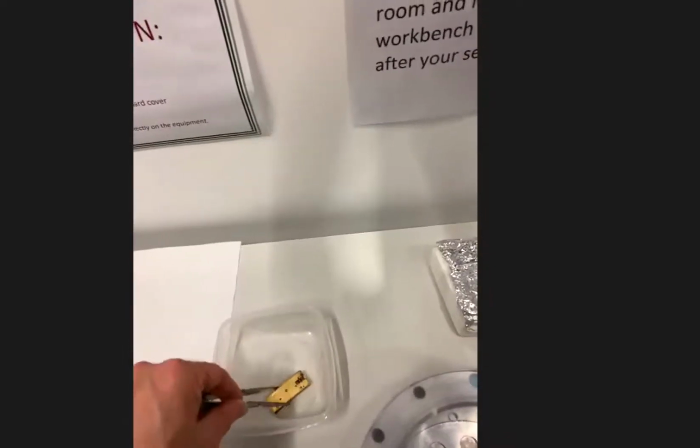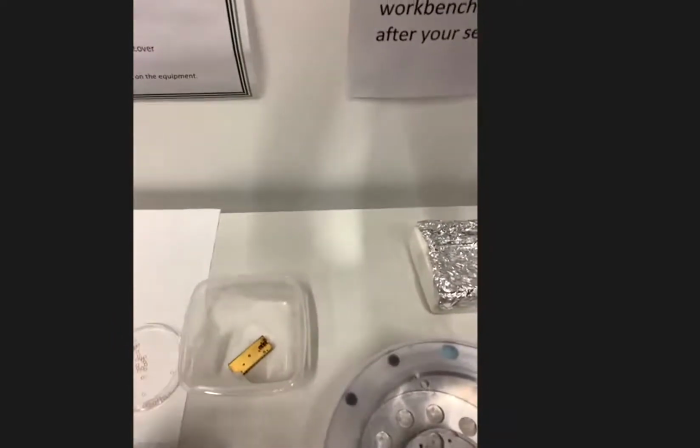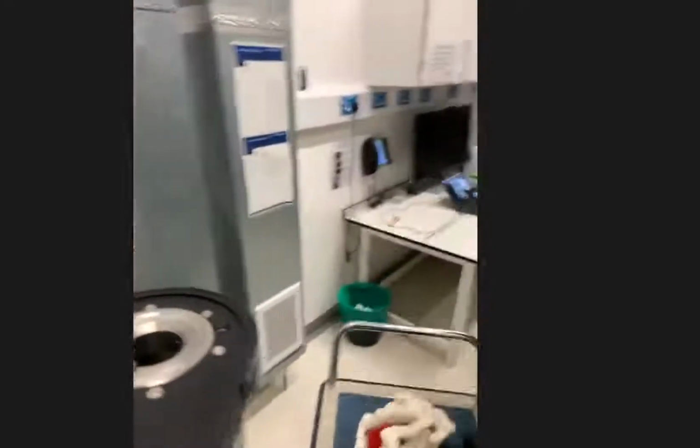This is the cassette where you put the grids, and then you put that into this structure, which we normally fill with liquid nitrogen. You would bring that to the machine and place it down.